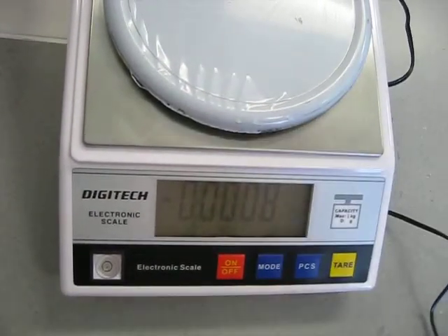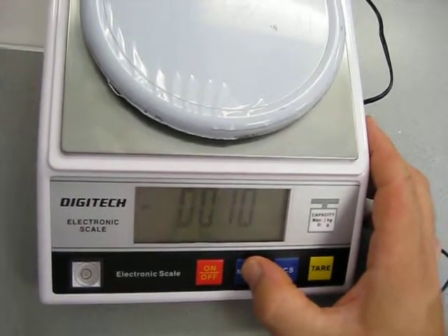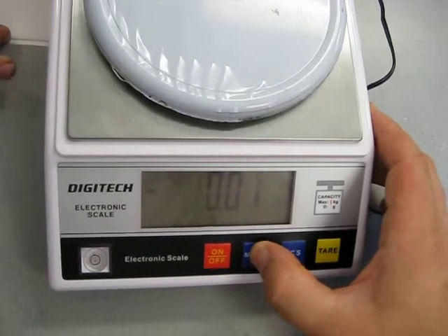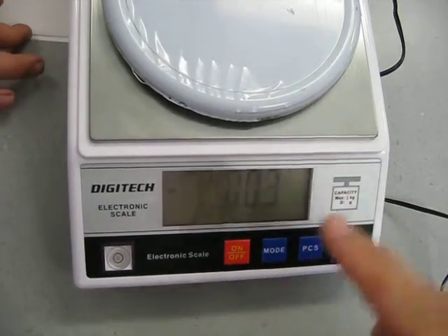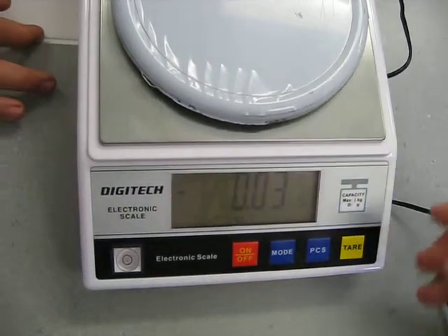What unit do we want? Grams — good work. Grams looks like the little 'g', which is where it started, and we'll get there eventually. At the moment it says 0.03, moving around a bit.